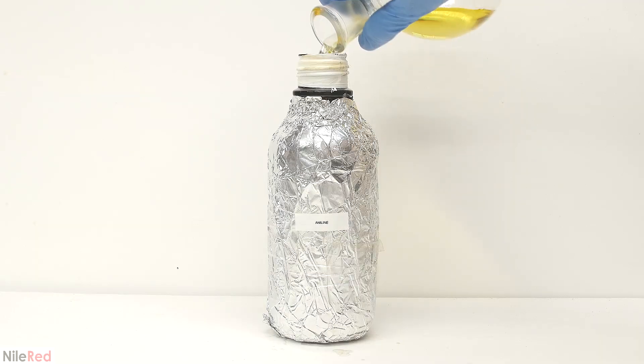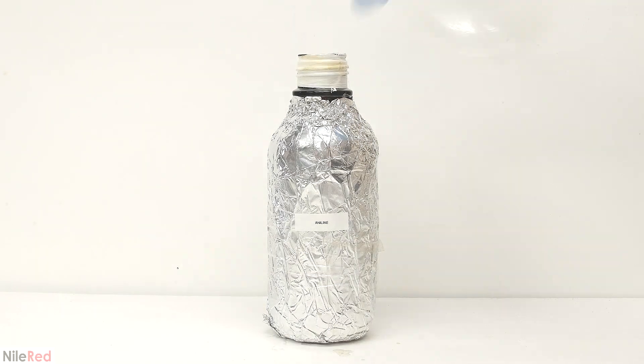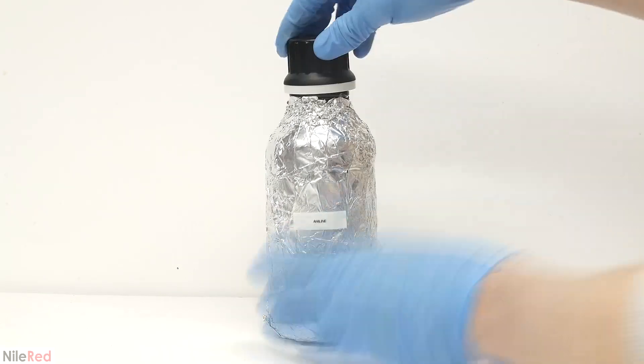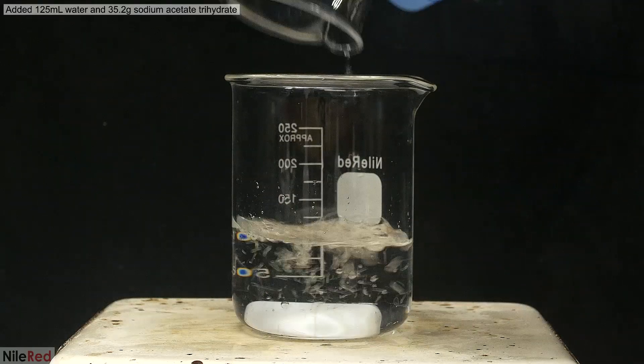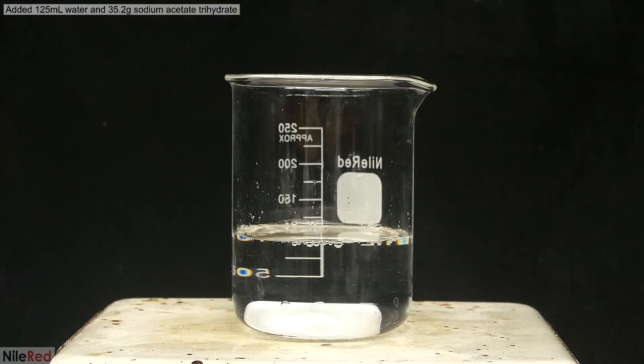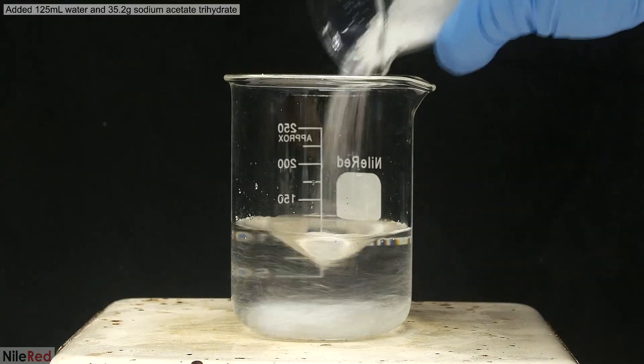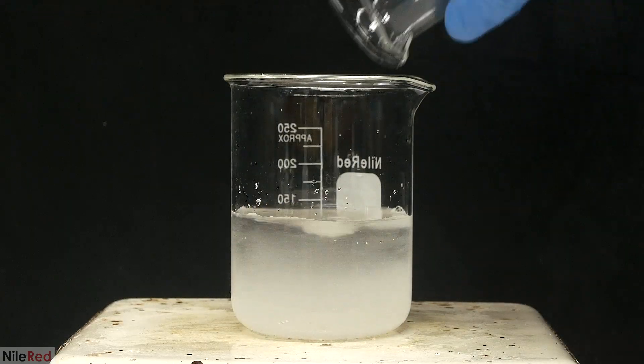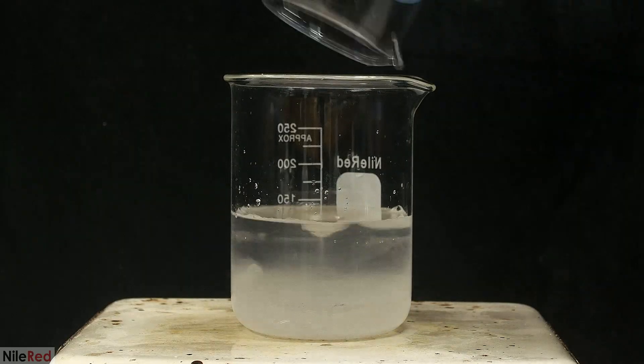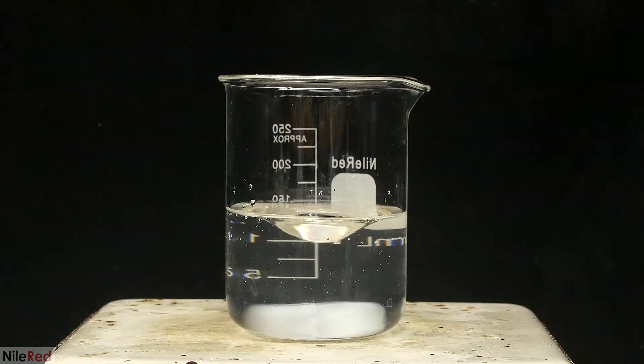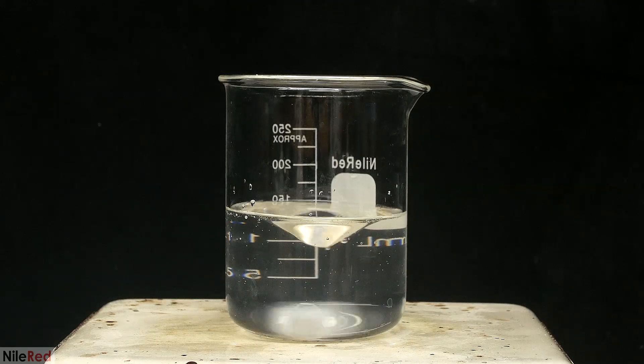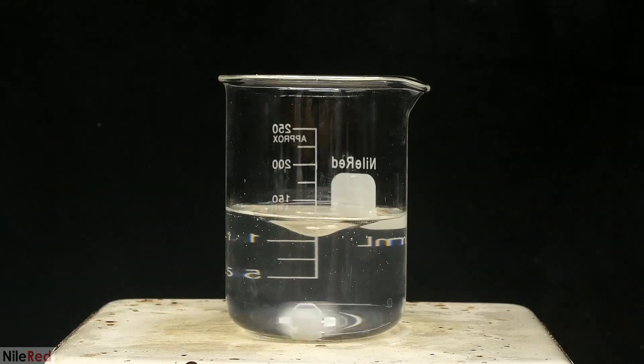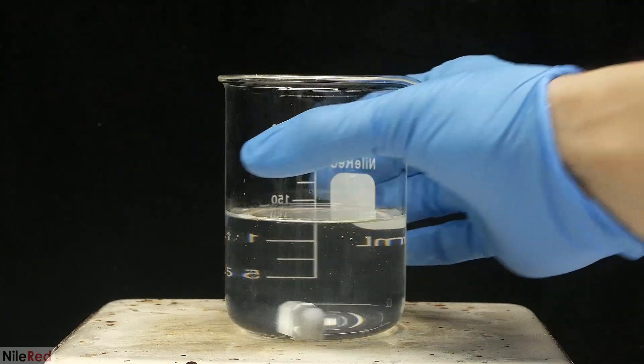Okay, so now that I know that the aniline is good, I can proceed on to the reaction. To start things off, I add distilled water to a beaker, turn on the stirring, and dump in some sodium acetate. This is going to take a couple minutes to dissolve. I come back about five minutes later, and I have a nice clear solution. I don't need this immediately, and it's temporarily placed on the side.